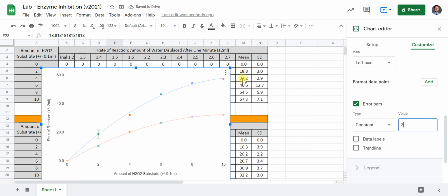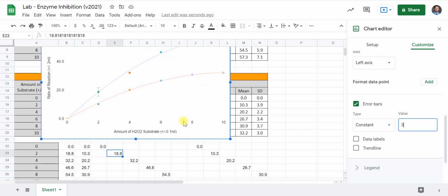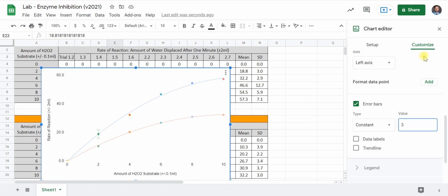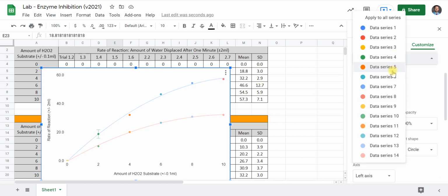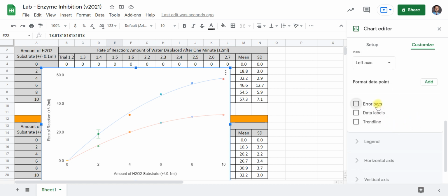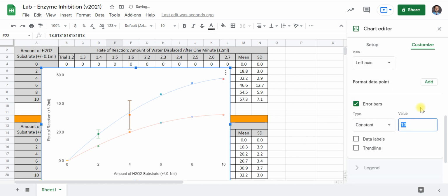Now we're going to come to the 32, which should be the next one. And you can see 32 is in the next column. We're going to enter 2.9 for 32. Okay, I'm going to enter, row 5, I believe. Error bars, it's kind of tedious that you have to do this. We'll enter 2.9. There you go.